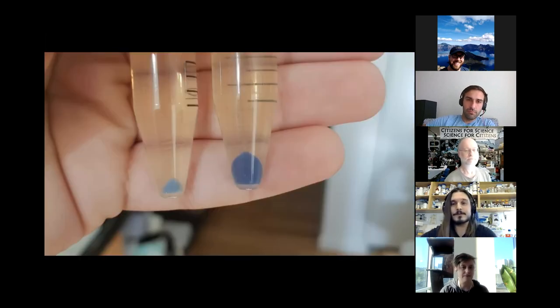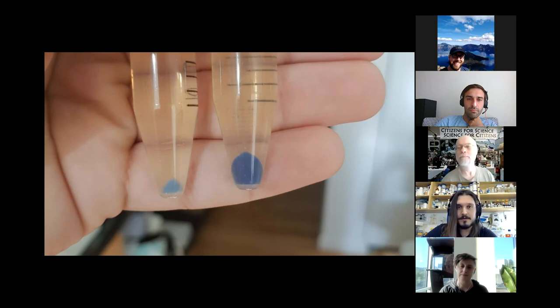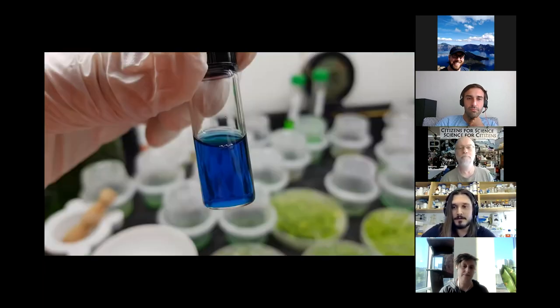So I started off with the sequence for the tropical clam. And after a bunch of PCR mutagenesis and some optimization, I got to the color on the right. And then here's a purified sample of the protein, right? This is crude lysate. It wasn't any His tag or anything like that. This was just the cells were cracked, run through a filter, and called it a day. So I was looking at this blue protein and I said, okay, blue, cool. Let's try other colors, right?